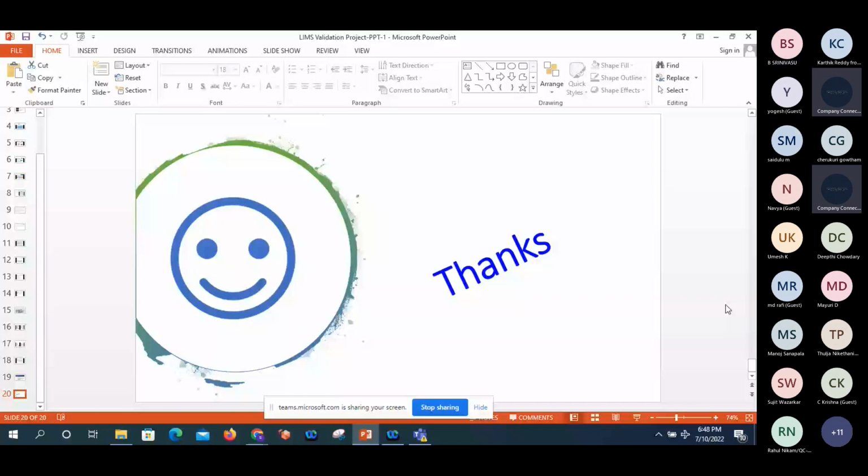We will mention that these are the requirements, for example master data creation as a requirement, and these are the steps. During the testing, we have to verify whether the master data has been created for this purpose or that purpose. That will be explained, but not the operation of the software. For the operation of the software, we would have to purchase it, and the license cost will increase. So ultimately the burden of the application purchase is on you only. Okay. So we'll go through the CSV validation, not the operation. Operations is the work of an operator, not our task.